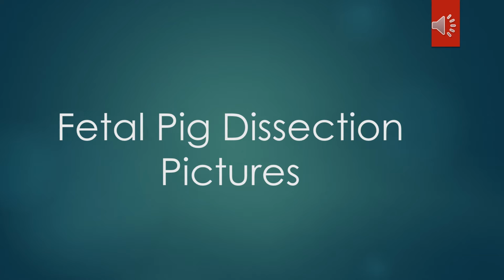I hope you're having fun doing the dissection. It is my pleasure to have you guys do this, but make sure that everybody in your group is actually working and that everyone's following the directions. I'm going to go over what the structures are in the pictures of your packet so you can correctly label them. So this should really help you out today. Then you can share your information with the rest of your group as they're dissecting, so you can actually share the information as you're looking at the parts that they're taking out.